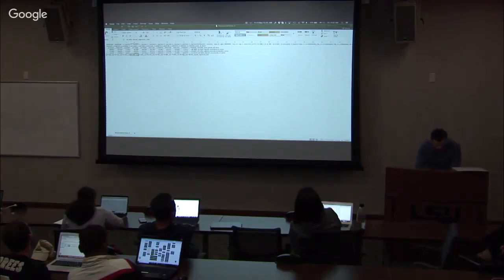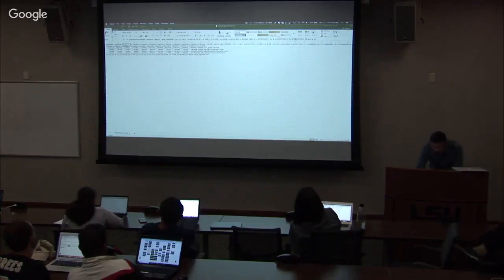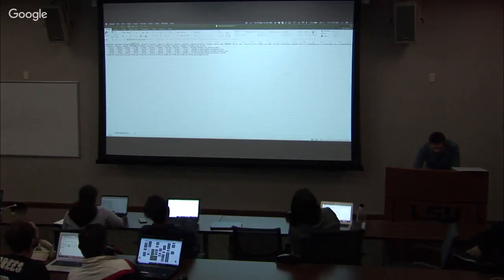So if you now clean up this table and just leave the sample names, you can actually see, okay, let's say I'll take the first four, not to take up too much of our time. And I can create a little bar plot of the alignment between these different samples.